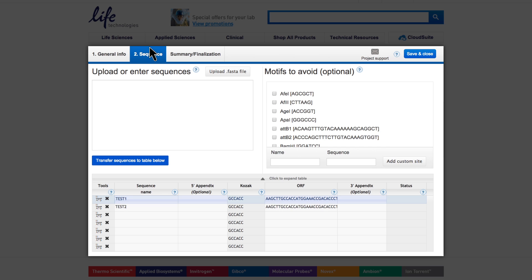If you require cloning, add the flanking cloning sites or UTRs by including them in a second step using the 5' appendix and 3' appendix fields. These sequences will be avoided during optimization.